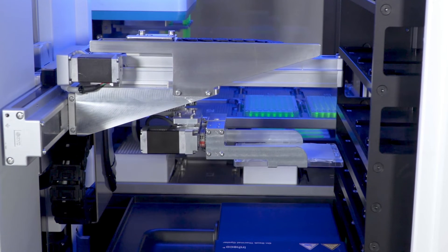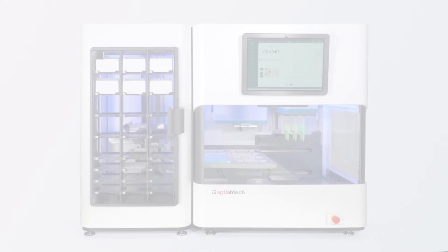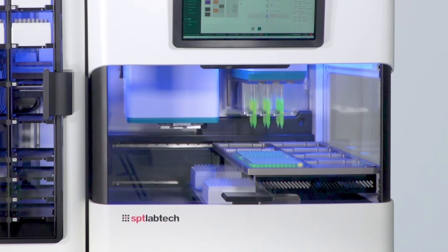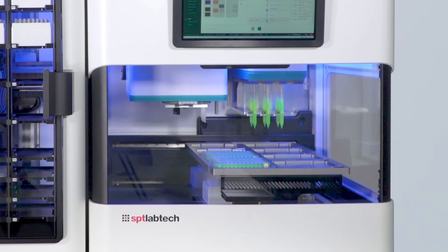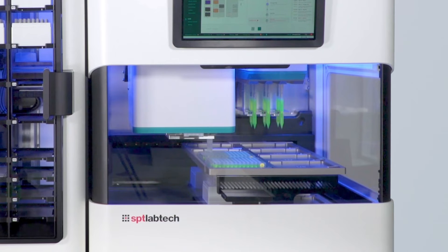So far we've seen a wide range of capabilities of the Firefly PLUS for cases where users desire more walk-away time and higher throughput. You can see the pipetting head on the Firefly has gone down to pick up a column of tips. These tips will be used to perform pooling on the plate that was returned from the on-deck thermocycler.